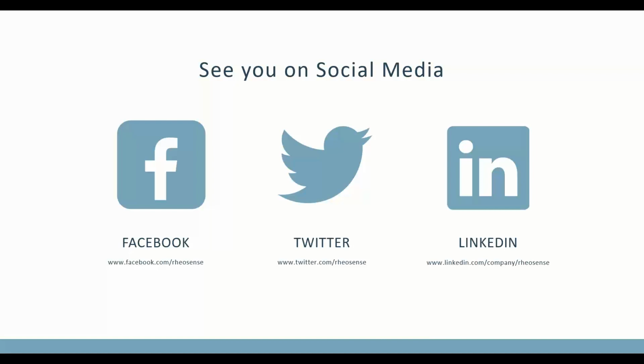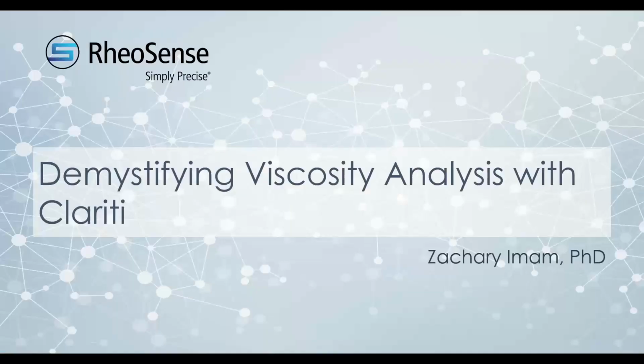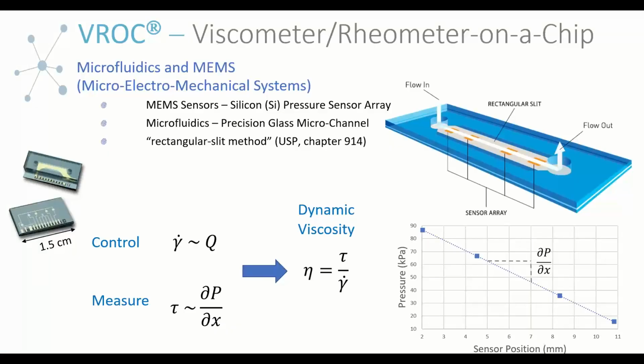Hello, everyone. I'm Zach, and like Eden said, I'll be walking you through some of the basics with our data analysis software, Clariti. It's built in-house, so it's proprietary, and it only works with our systems. With that being said, I'll go briefly into, like we do with every webinar, our microfluidic system, m-VROC, which stands for viscometer rheometer on a chip.